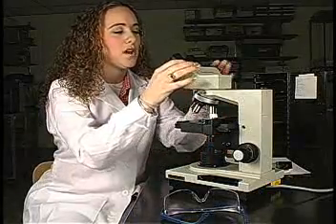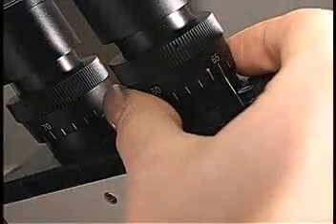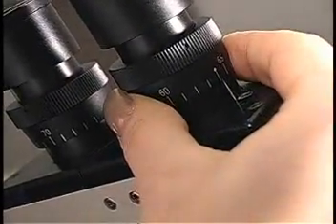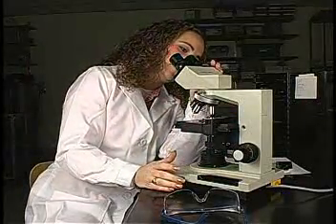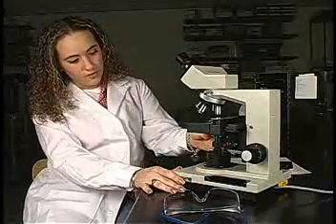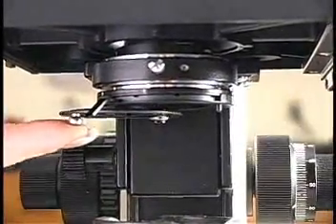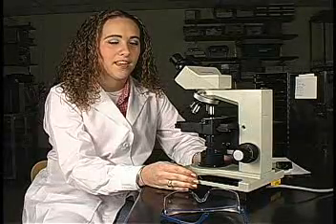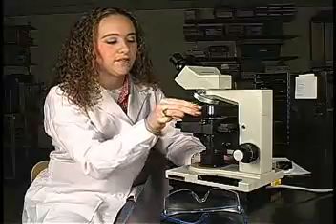Next, you want to make sure that your oculars are even. You can do this by setting your right ocular at 64 and your left ocular at 64. Next, you're going to make sure that your blue filter is in place. Lastly, you want to make sure that the 4X objective is in place.